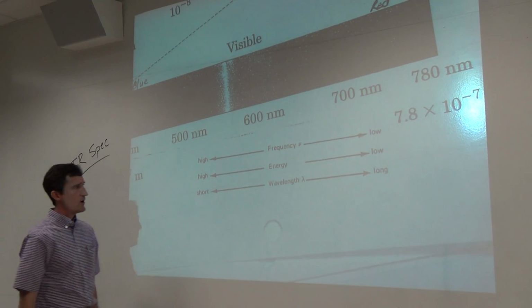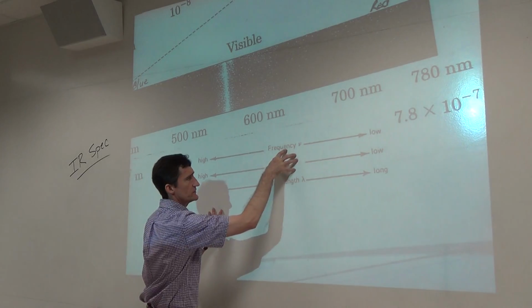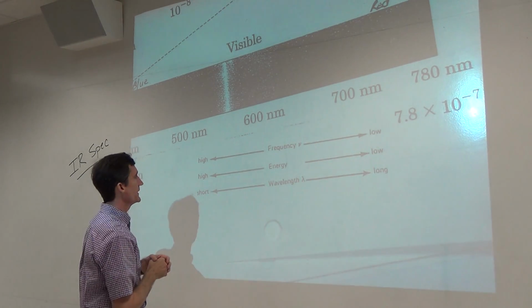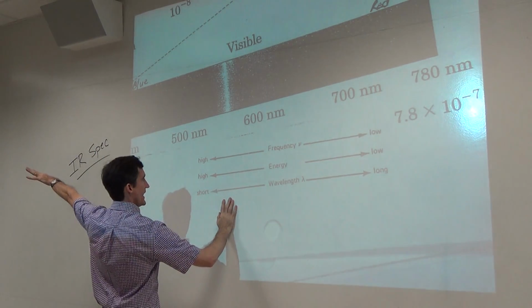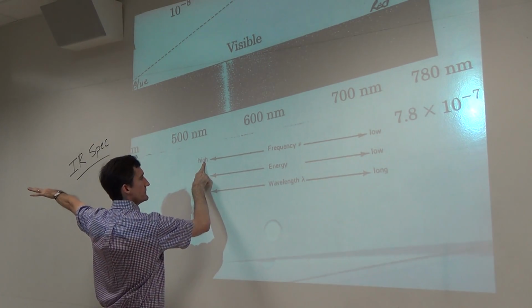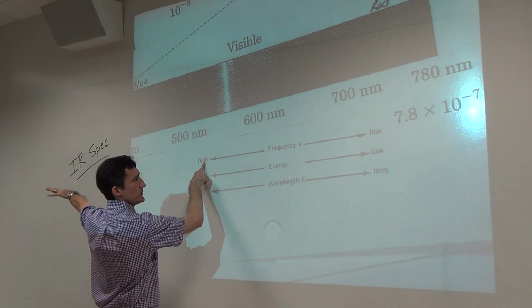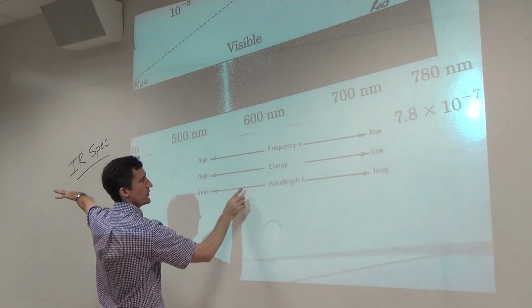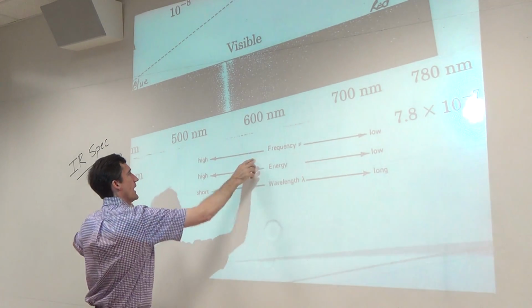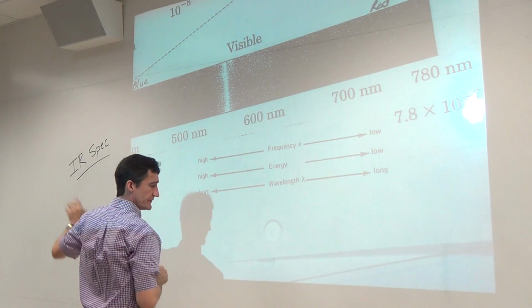When we look at an IR, these trends are the exact same on your standard IR. That is, this is the high energy end of an IR, this is the high frequency end of an IR, and typically we will talk frequency, although reciprocal wavelength is actually applied. So, high frequency is to the left.